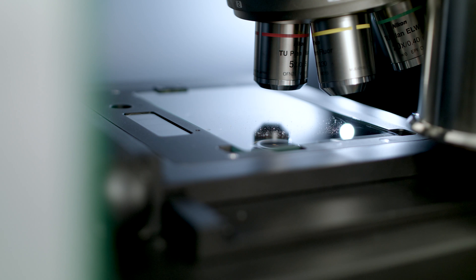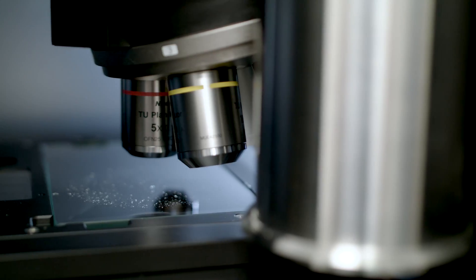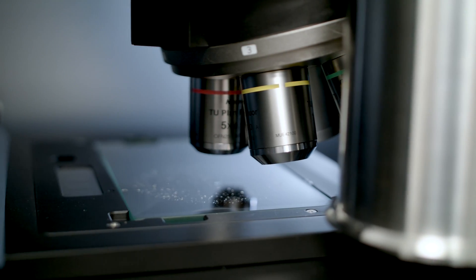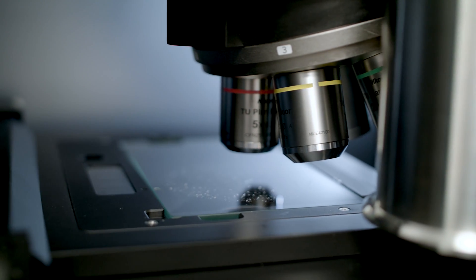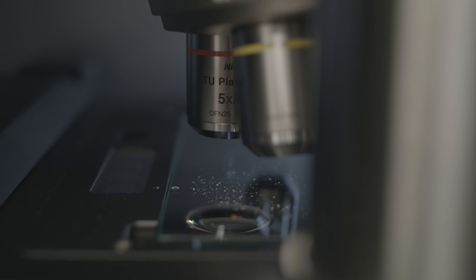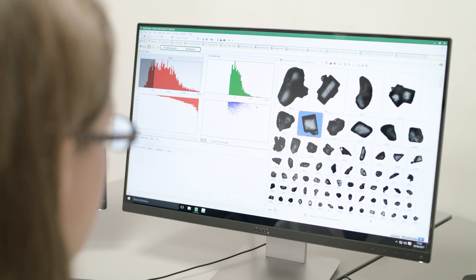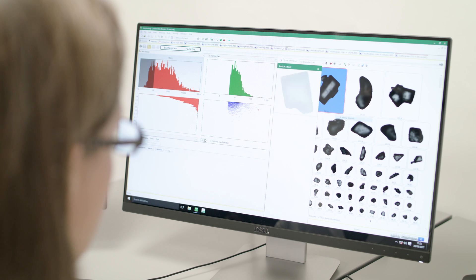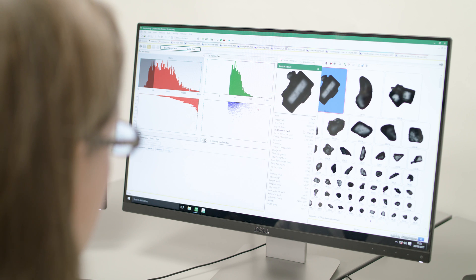Morphology 4 delivers clarity and reduces costly analysis time by rapidly providing detailed quantitative analysis of thousands of individual particles, allowing quick visual and statistical data interpretation.